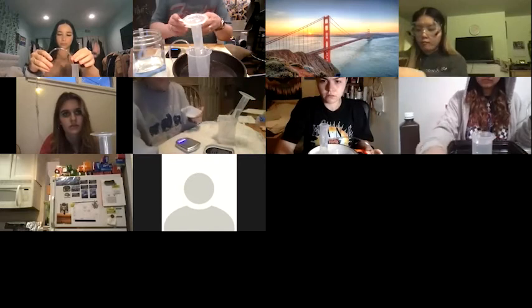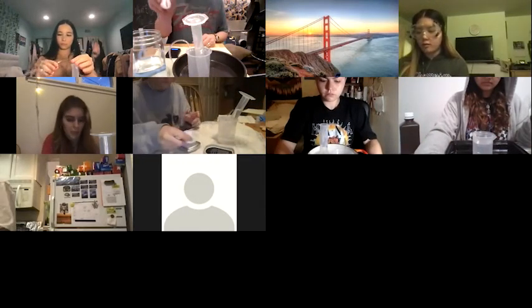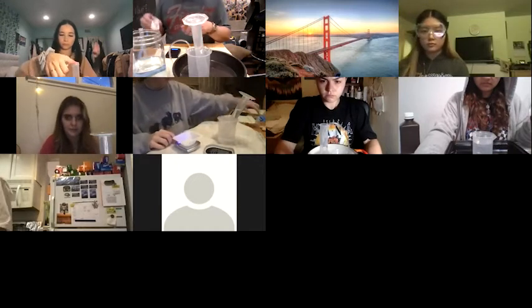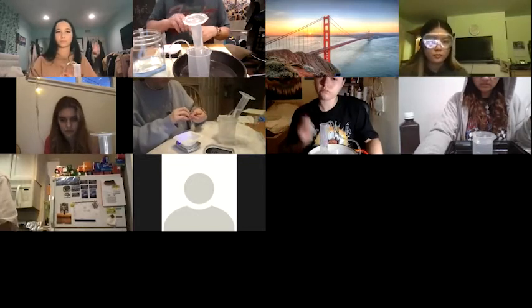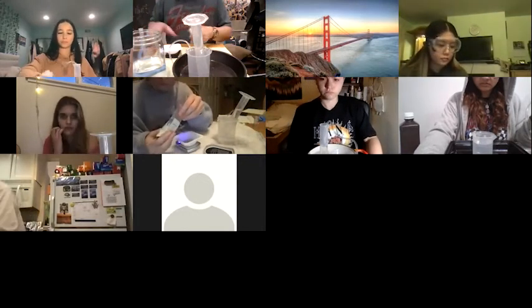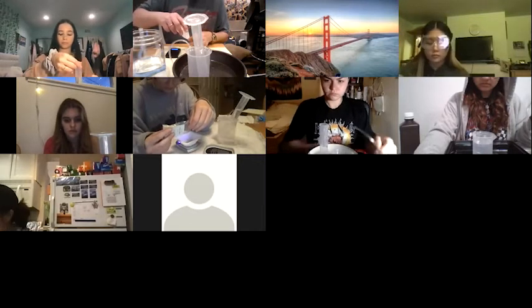And remember, this folds. When you fold it like that, it makes putting it into a small container much easier, because it's not a very big opening.